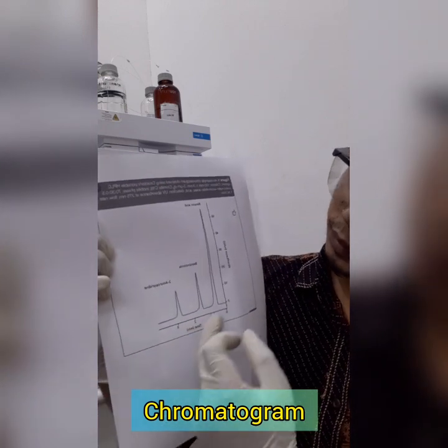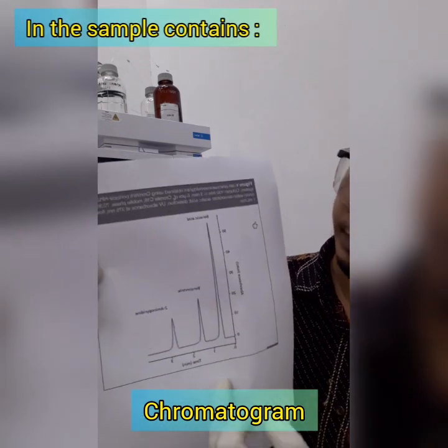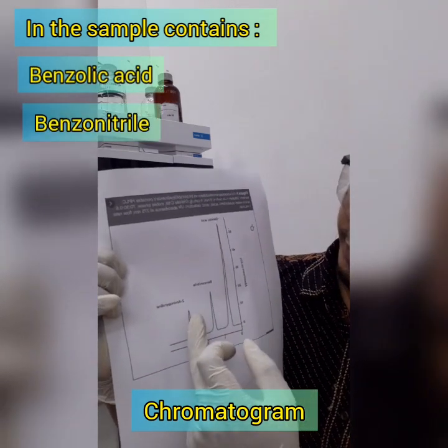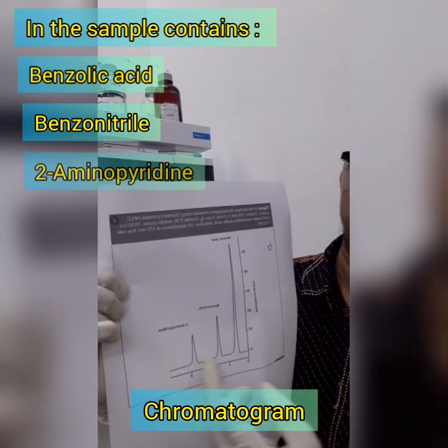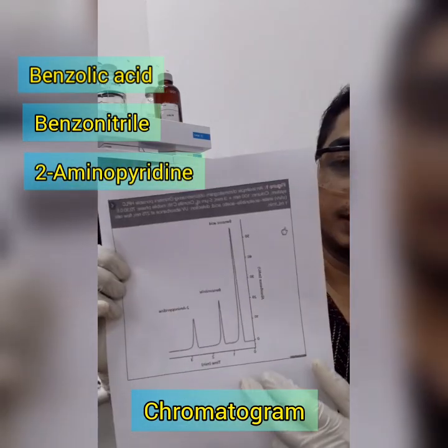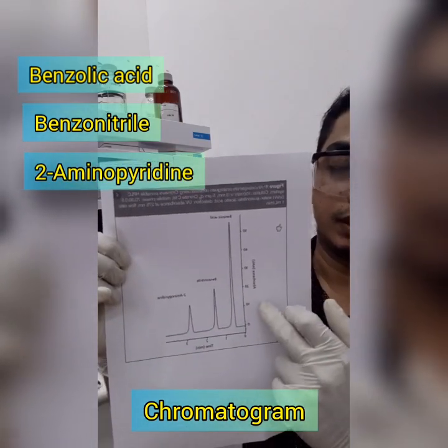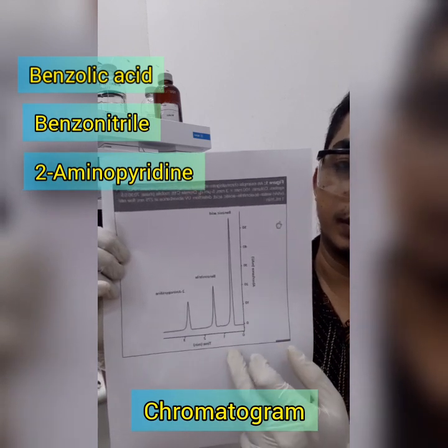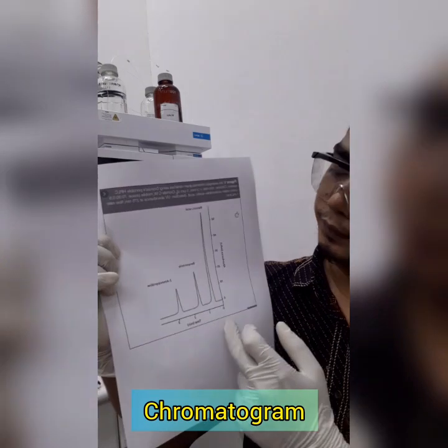Here you can see benzoic acid, benzonitrile, and 2-amino pyridine. This is one example of an HPLC result for this analysis.